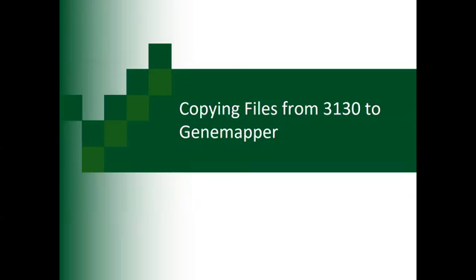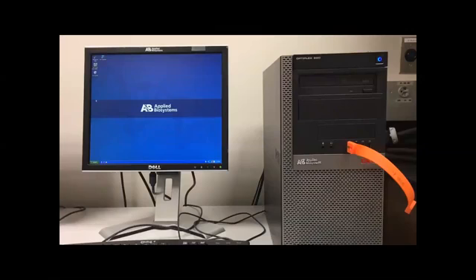Hello, this video is very specific to our lab in UBOB at UAB, and it's about copying files from one computer to the other: from our 3130 data analysis computer, or excuse me, from the data collection software computer to the GeneMapper computer.